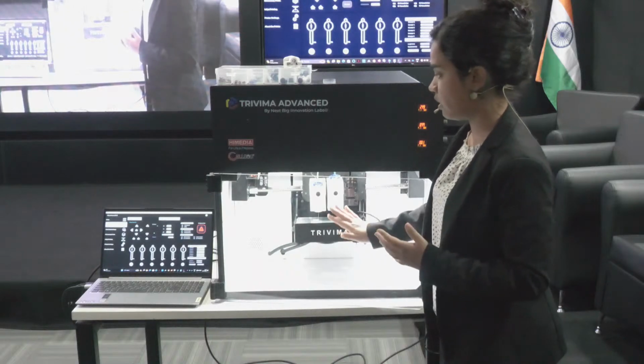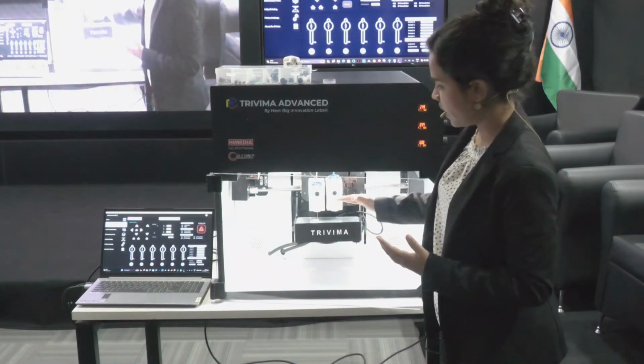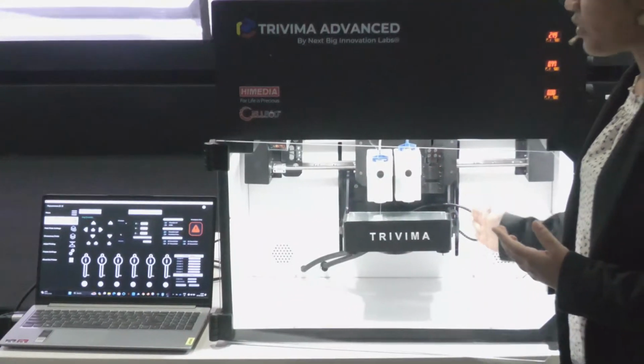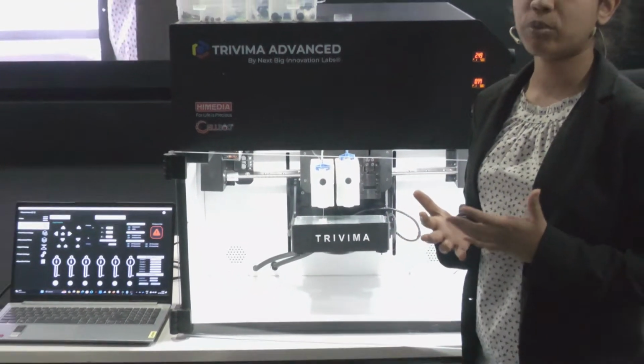So I have spoken about the temperature control of the extruder heads. I've spoken about the temperature control of the print bed over here. Now, as you can see, the print head moves in the X and Y direction and the print bed moves in the Z direction. So this X, Y and Z motion ensures a 3-dimensional object can be printed.